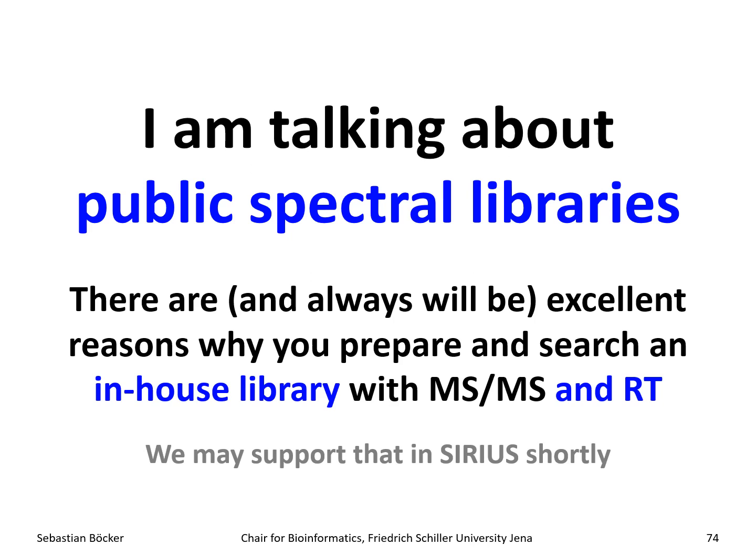And I really mean public spectral library here. I don't refer to in-house spectral libraries, and I believe that those in-house libraries where you have measured both the tandem mass spectrum and the retention time of the compounds will be very helpful for many, many years, and I hope that we will have support for searching those shortly in SIRIUS, which would be very helpful. But what I'm talking about here are large public spectral libraries, also commercial libraries, where the compound has not been measured on your instrument, and also you don't have recorded the retention time for exactly your instrument.